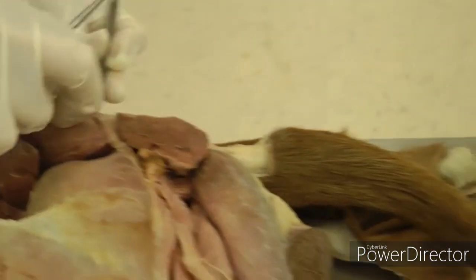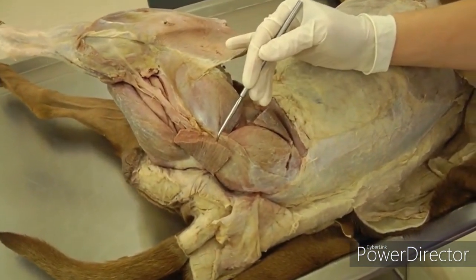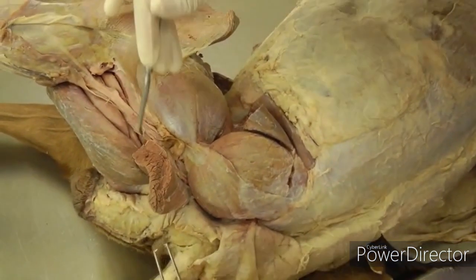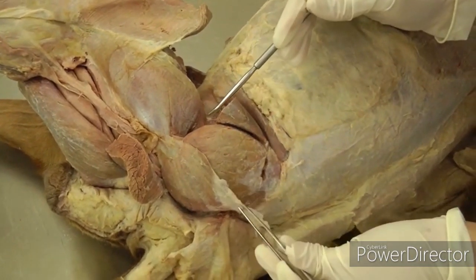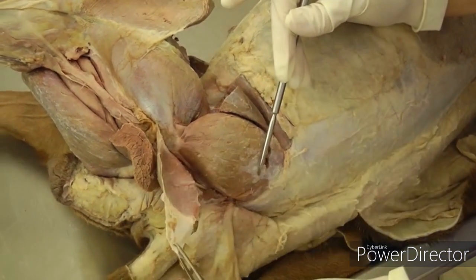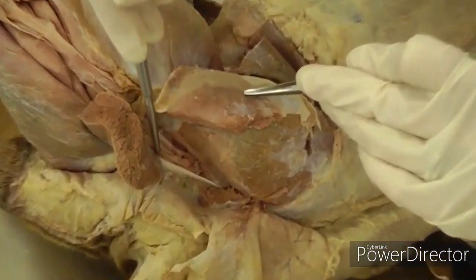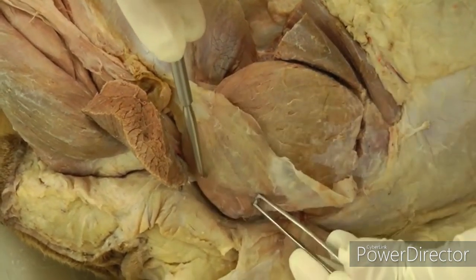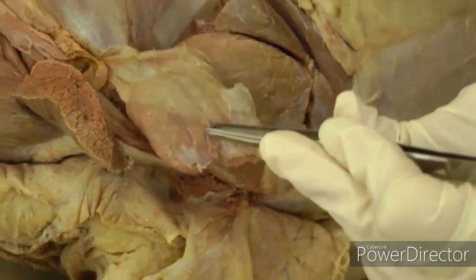Now on the dorsal aspect, look at the gluteal muscles. Here is the transected biceps femoris — lift that up. You have the superficial gluteal, which is flat and thin with an aponeurosis. Separate it out starting on the cranial edge, cut the aponeurosis, and reflect it distally. Be very careful caudally because the sacrotuberous ligament is right there — the biceps femoris attaches to it, and the superficial gluteal is stuck right to it. Superficial gluteal reflects distally.